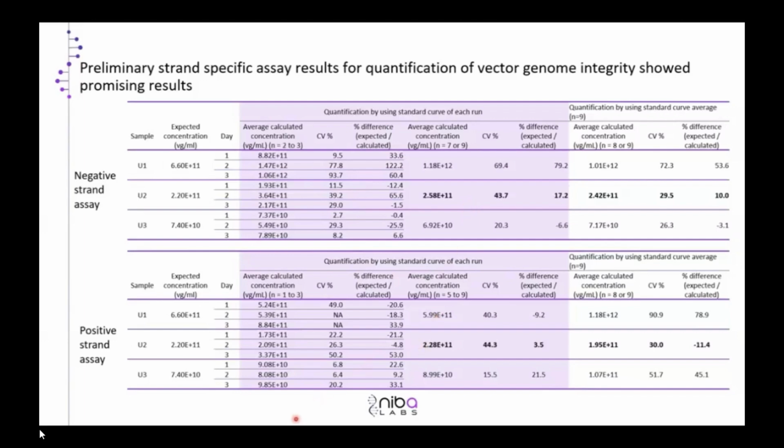So why the variability? I did not mention that before. Since we have a longer DNA strand, there is a chance, of course, that this strand takes some form of, let's say, a shape that is like a small ball, so that the signal is closer to the probe, or it can be a bit more relaxed or stretched, so the signal is a bit farther from the probe. And that is the reason why we might get a bit higher variability at the level of the genome integrity assay.